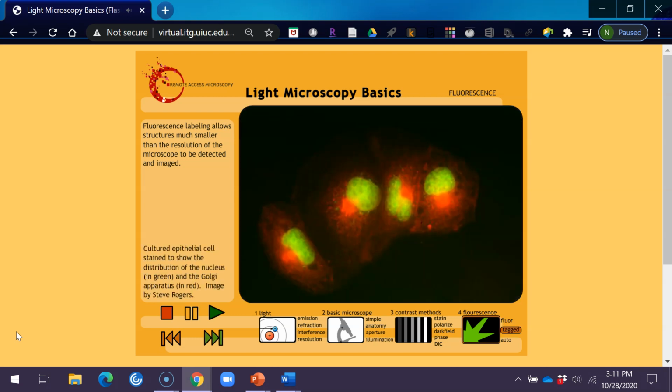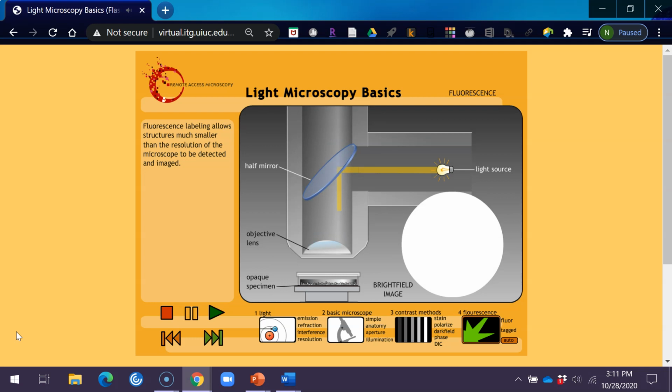The wavelength range that a fluorochrome will absorb and the color it will emit is dependent on the chemical structure of the fluorochrome. Microscopists will use different fluorochromes to tag antibodies to various parts of the cell, so that the nucleus, for example, will fluoresce a different color than its surrounding cytoskeleton. There are many different methods used in fluorescent microscopy. The following describes how an autofluorescing substance is imaged.